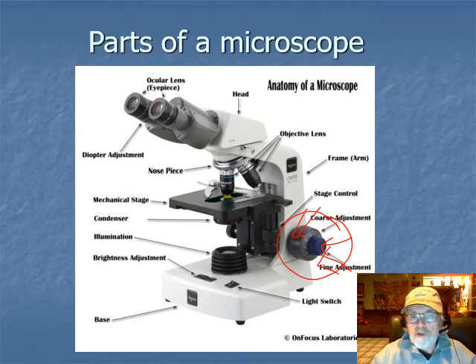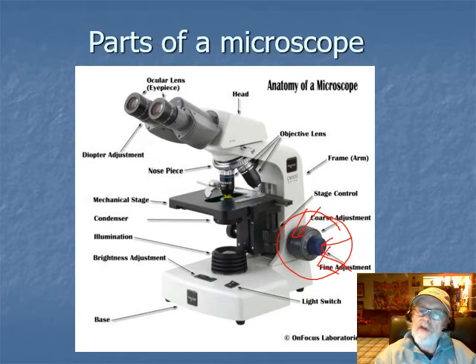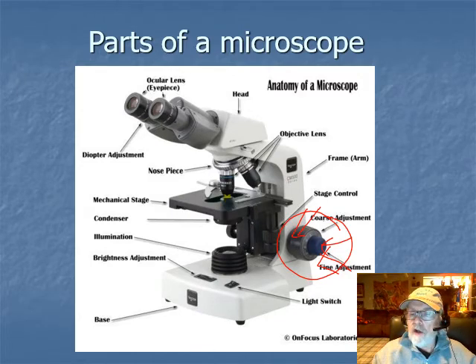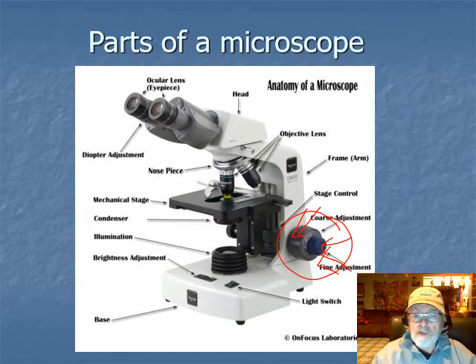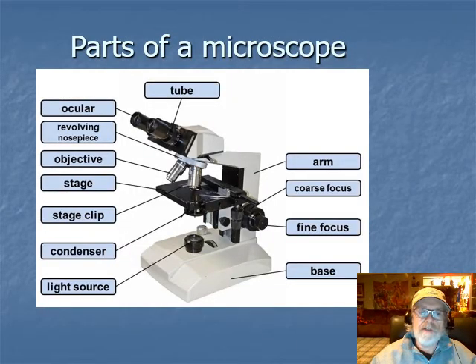Also, when I change powers on the objectives by rotating the nosepiece, if I have it in focus under a lower power it will be really close under a higher power too. All you have to do is use the fine adjustment a little bit one way or the other and you'll get back in focus without having to use the coarse adjustment.